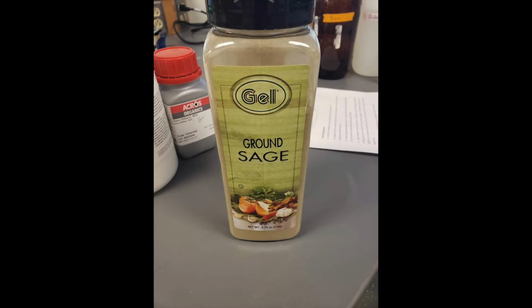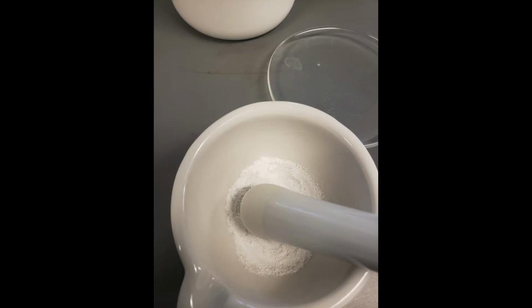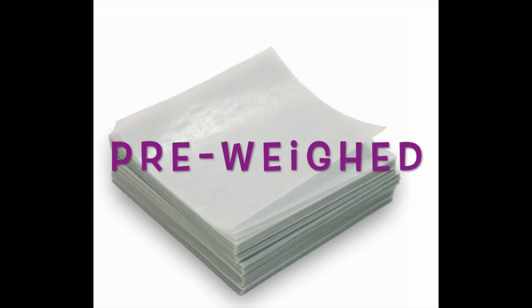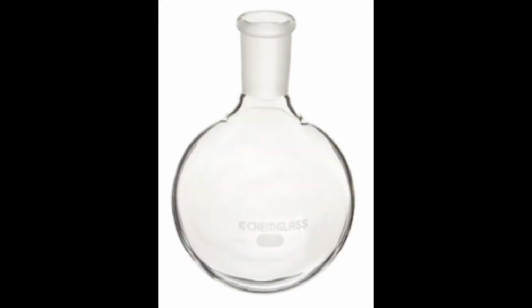Once you select your spice, record its identity and its color and odor in your notebook. Weigh out approximately 4 grams of the spice. Grind the spice up into a powder using a mortar and pestle. Then pour that ground spice onto a pre-weighed weighing paper and record that mass that you will be using in this experiment.